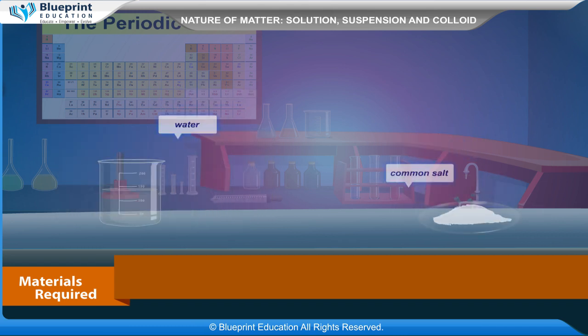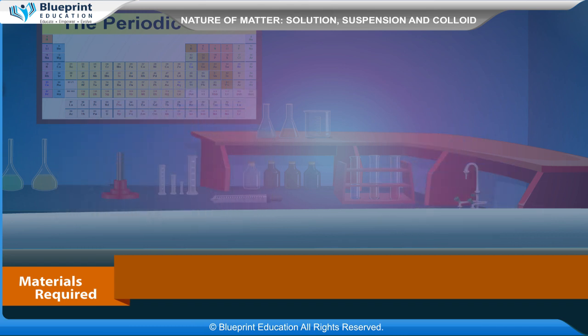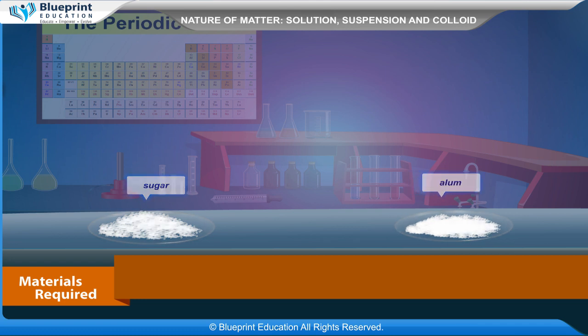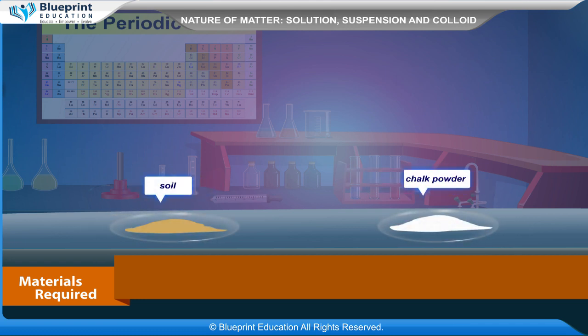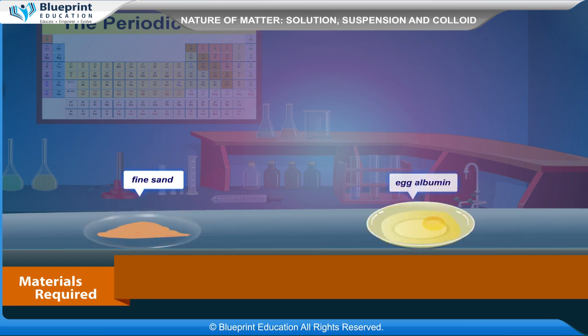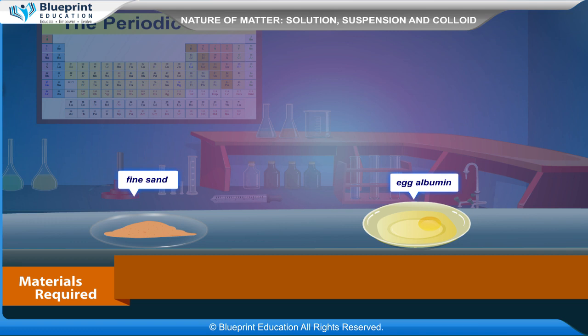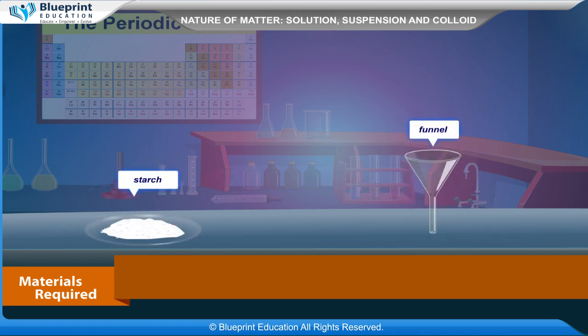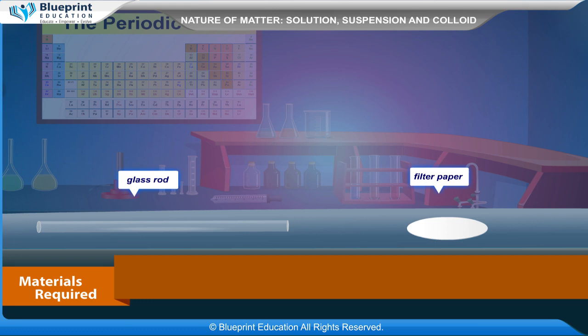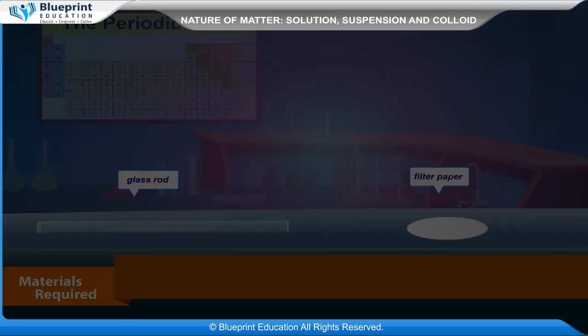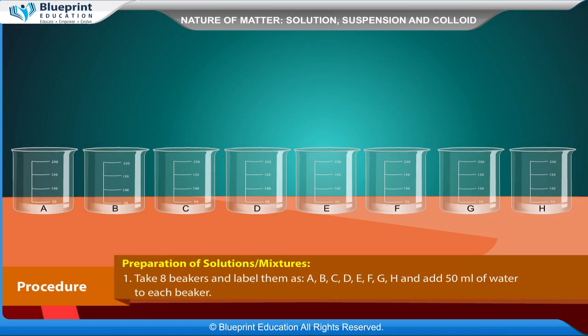The materials required are test tubes, beakers, water, common salt, sugar, alum, soil, chalk powder, fine sand, egg albumin, starch, funnel, glass rod and filter paper.